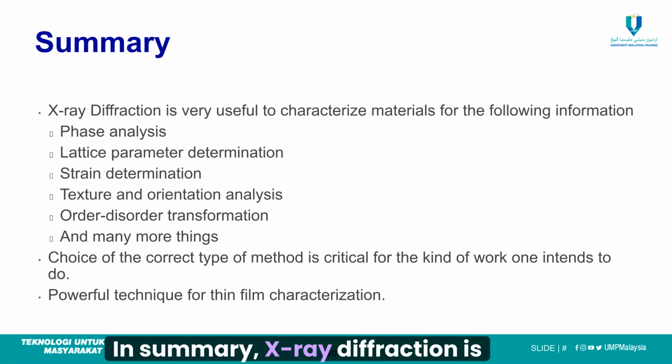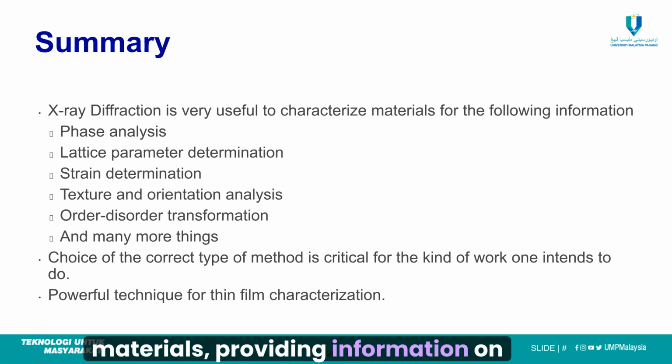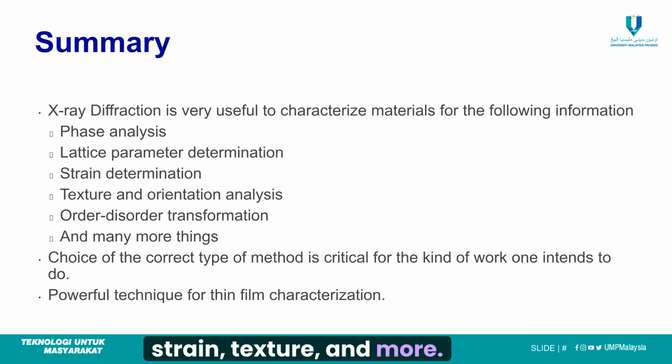In summary, X-ray diffraction is highly useful for characterizing materials, providing information on phase analysis, lattice parameters, strain, texture, and more. Choosing the correct method type is critical. It is a powerful technique, especially for thin film characterization.